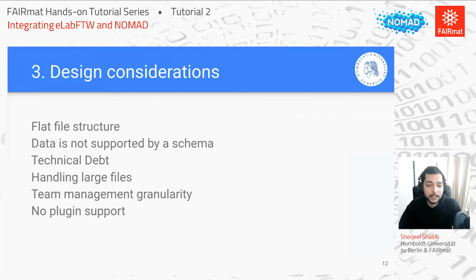And so this brings me to the design considerations that I had. Like with all these developments, there were a few problems that I faced. In the talks yesterday, we showed how we were using our microscope acquisition software directly on the server and running analysis with that as well.